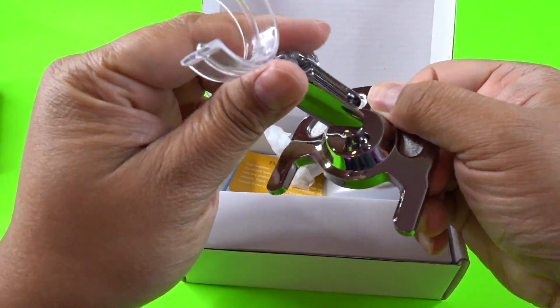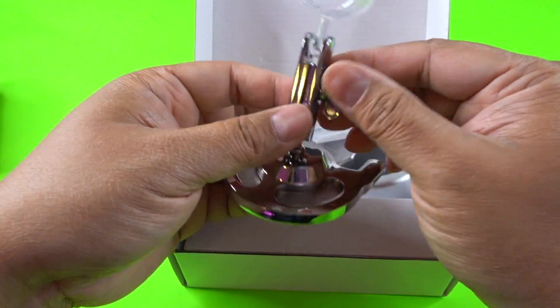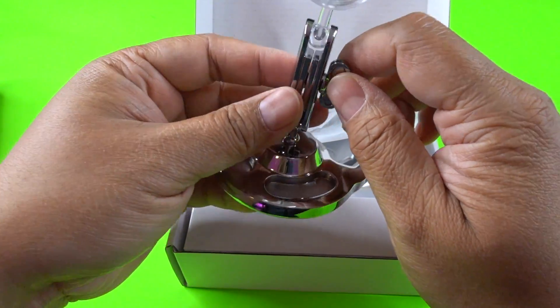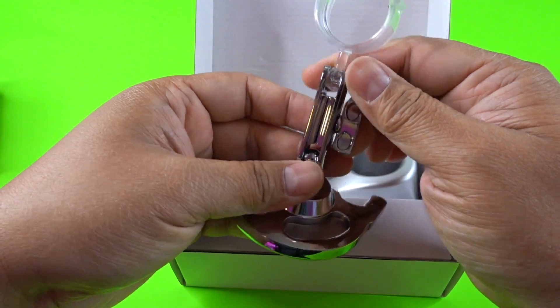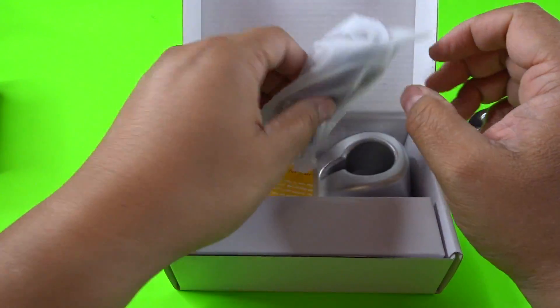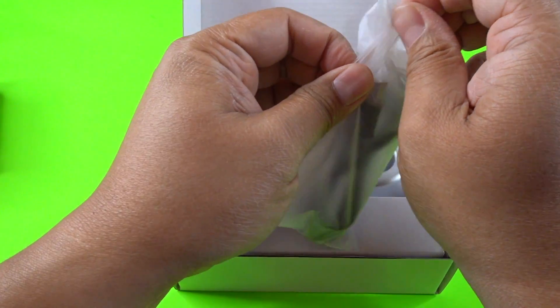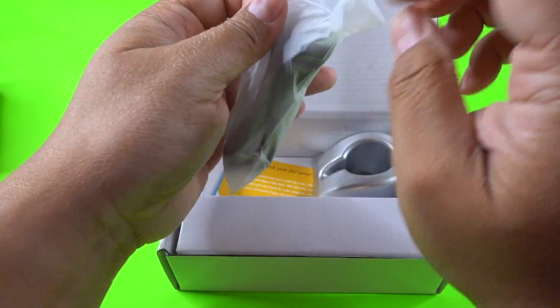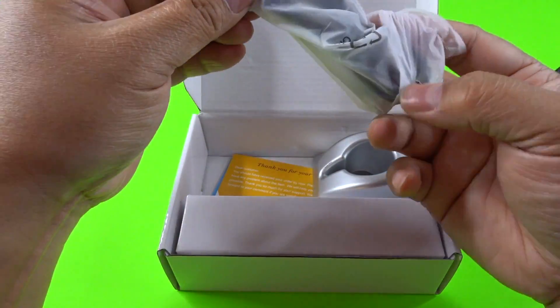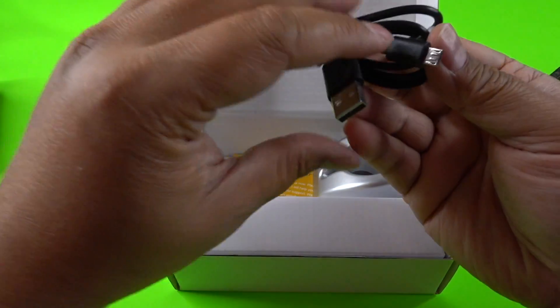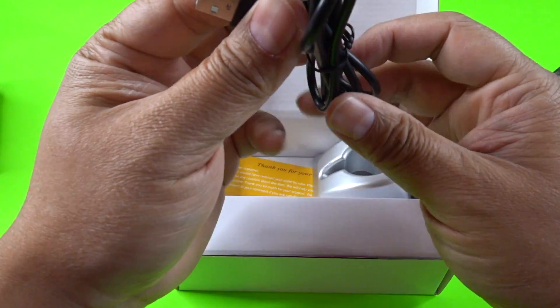Alright so the first thing I see is the stand. This does feel a little hefty on the bottom to hold it in place. And it's got this ball here that you can tighten to hold it in any position. Here is probably the charging cable. So here we have the USB to micro USB charging cable.